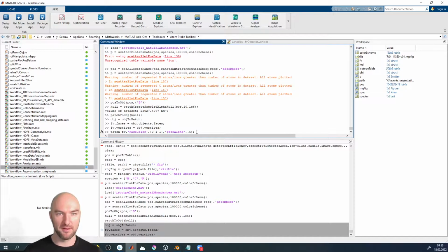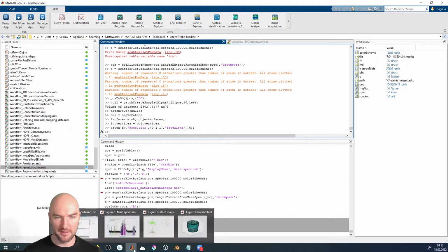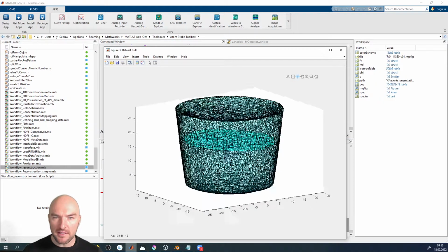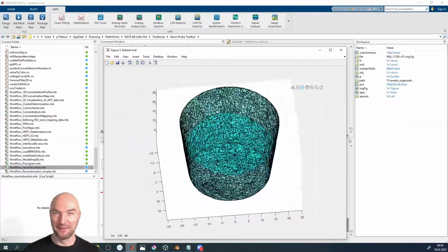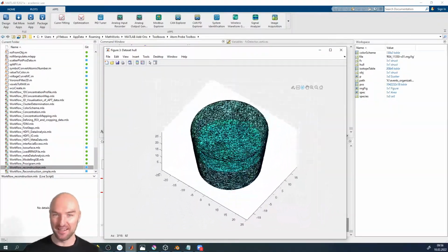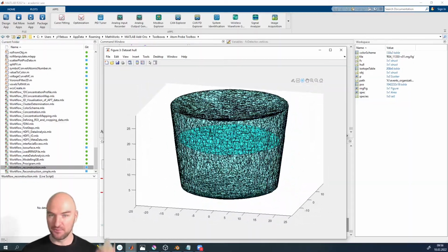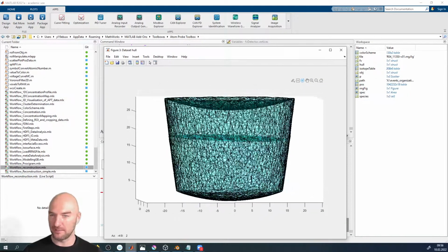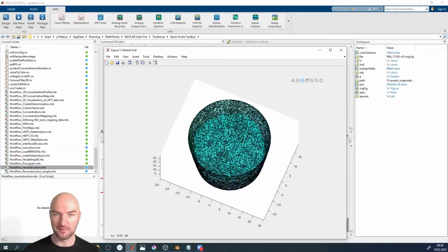It's our grain boundary, and now it should appear in here, and I probably should have also given it a different color so it's a little bit easier to see. But it's here, and it's sitting where it's supposed to sit. And we could already do a proxygram based on that, but we're not doing that because in the first session we are just going through how to model nice grain boundaries.